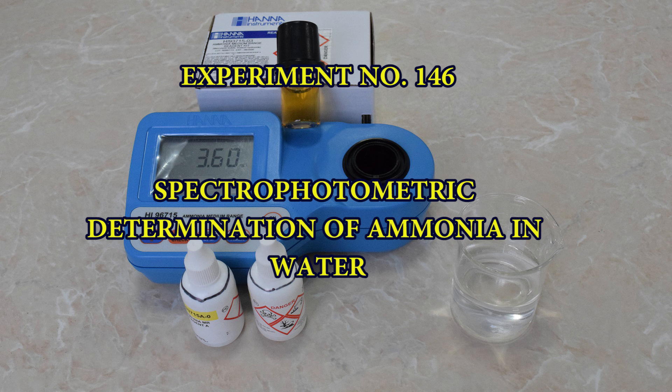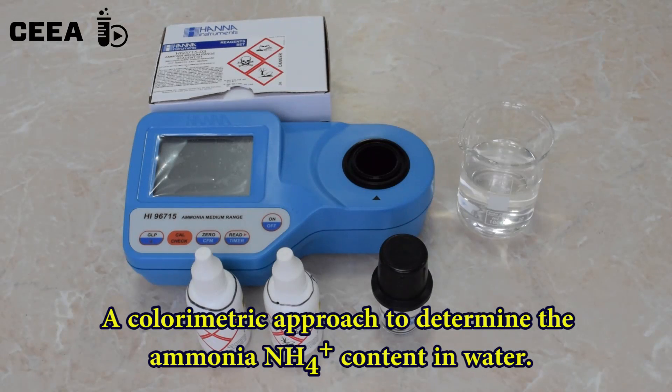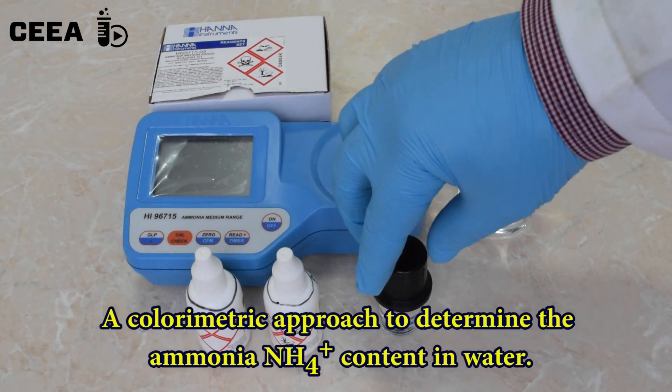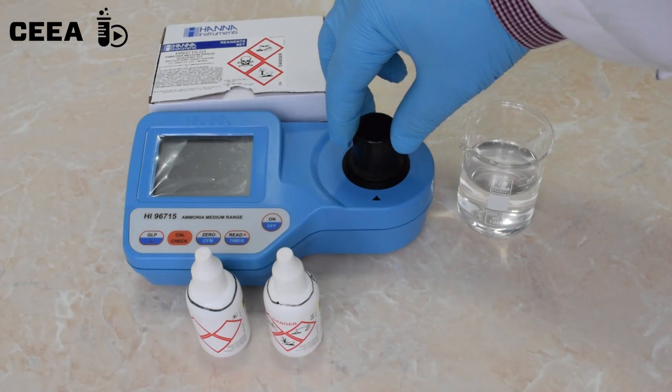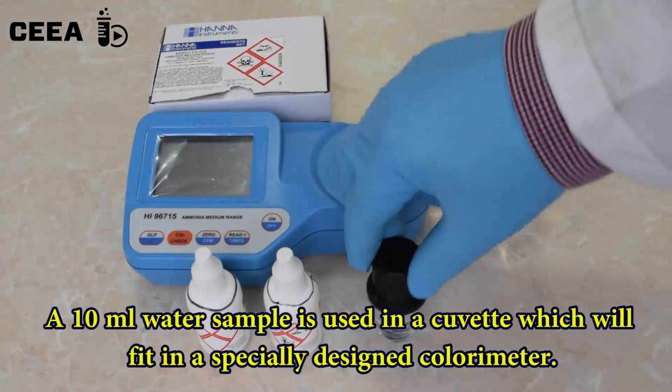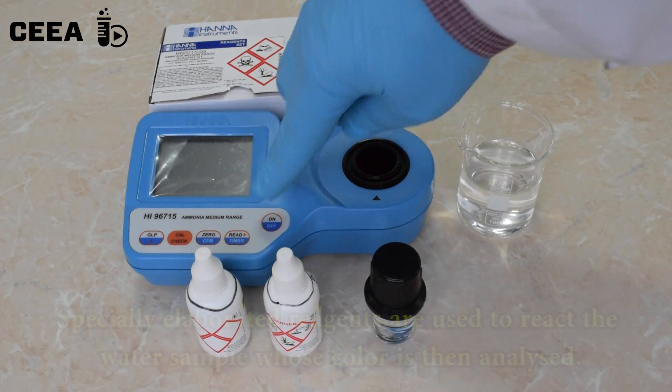Spectrophotometric determination of ammonia in water. Although the presence of ammonia in water is not raising toxicity concerns, it can give valuable information about the quality of the water well used for human consumption. Spectrophotometric devices help determining if ammonium ions are present when reacting a water sample with Nessler's reagent.